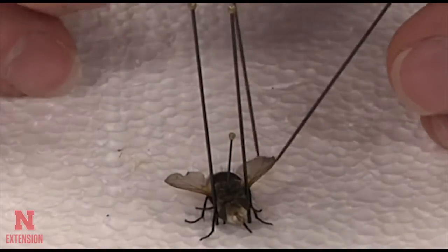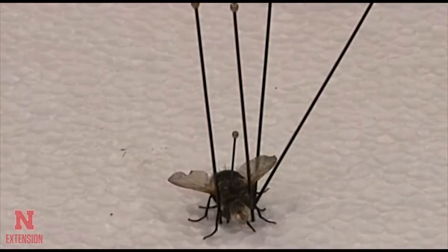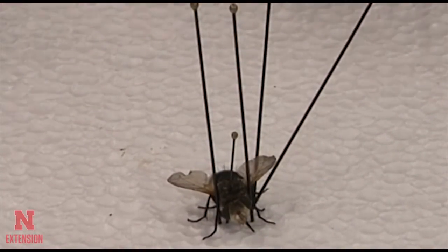Occasionally, you may have a leg that is difficult to hold in place with just the styrofoam, and you may need to wedge it into place using pins.